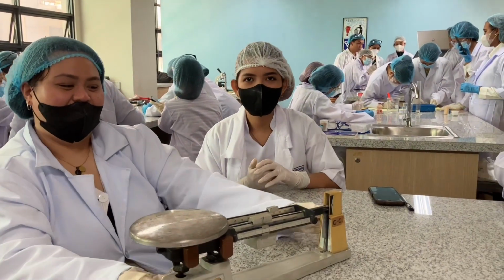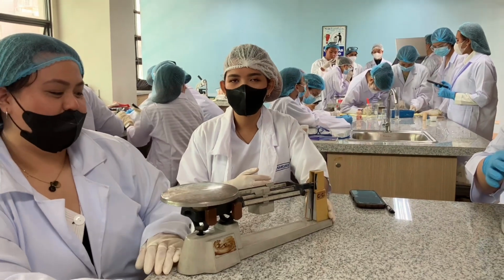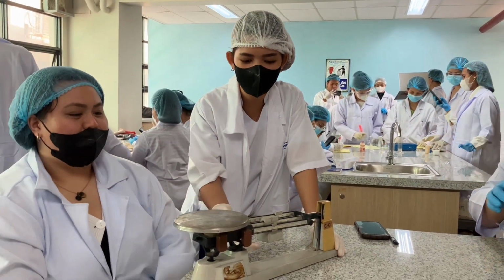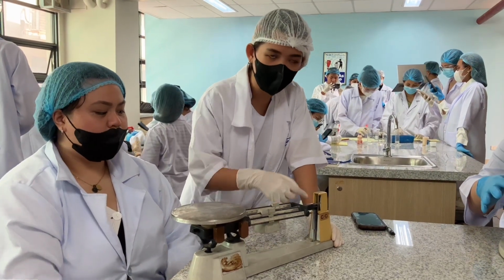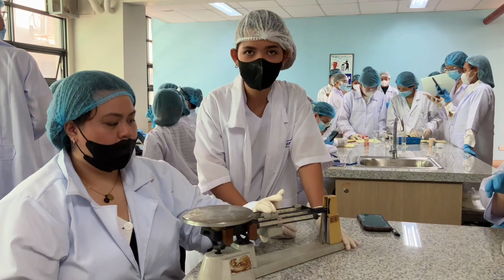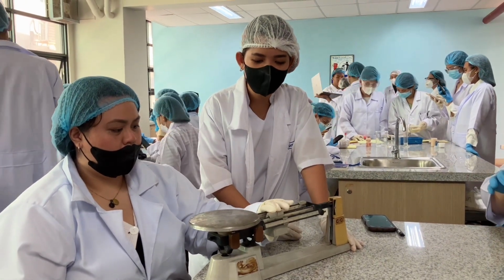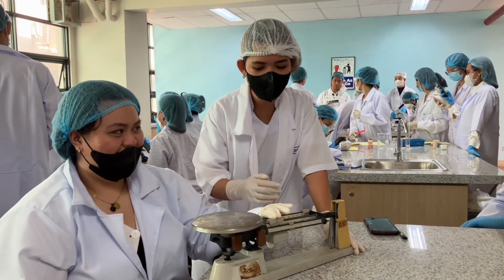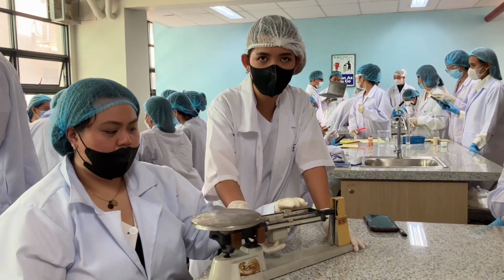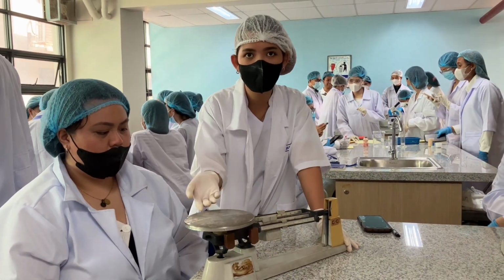So next we will talk about how to use the platform balance. So first we will empty the bag, and then next we will check if the scale reaches here. Next, after checking the scale, we will adjust the rider. So this is the rider, until it is completely balanced to the maximum.